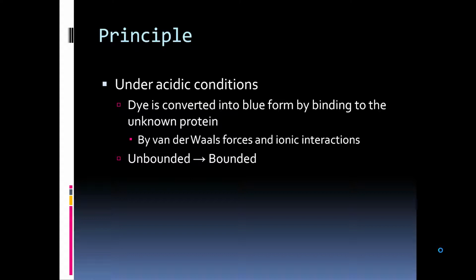These newly exposed pockets in the protein's tertiary structure bind non-covalently to the nonpolar section of the dye by van der Waals forces. This, in turn, situates the positive amine groups in proximity with the negative charge of the dye. The bond between the dye and the protein is further stabilized by ionic interactions between them, strengthening the blue form of the dye. Therefore, the amount of protein-dye complex present in the solution is the measure of protein concentration, which can now be estimated by utilizing its absorbance reading.